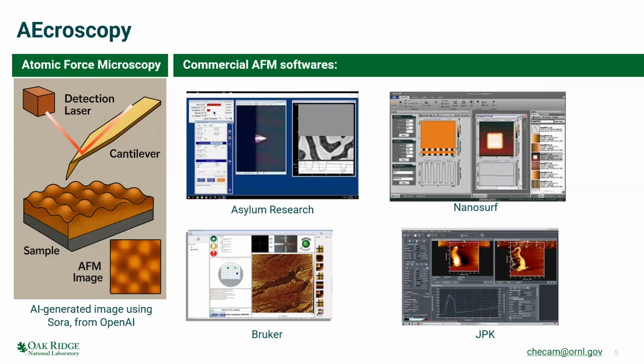The main advantage of an AFM for me is that you can not only get the topography, but also get some functional information. You can do electrical mapping, magnetic mapping, mechanical mapping, etc. And also you can use it not only in ultra-high vacuum, which is needed for other types of microscopy with such resolution, but you can work in liquid environments or with controlled humidity, etc.